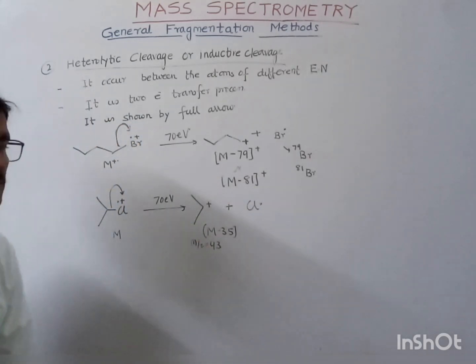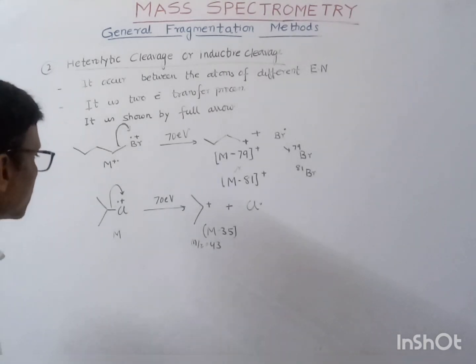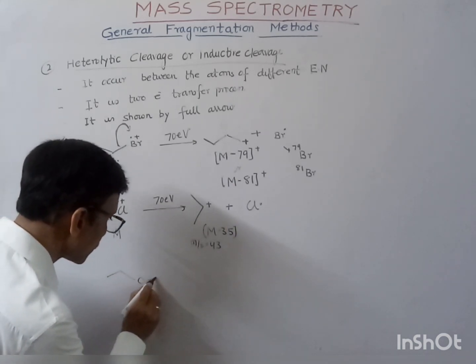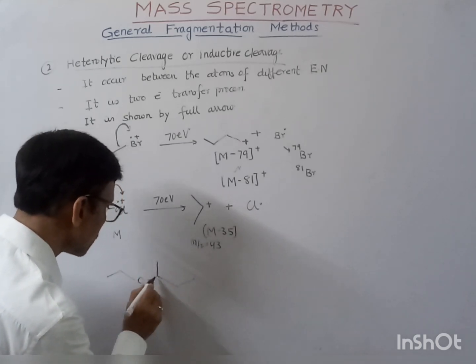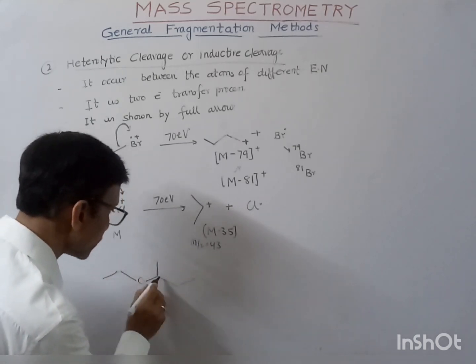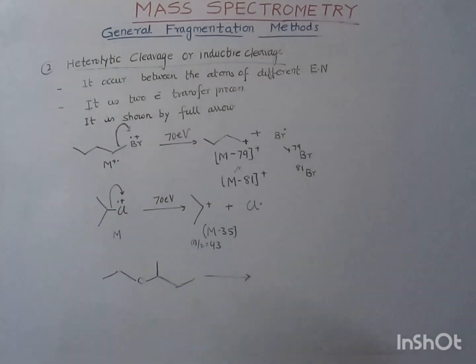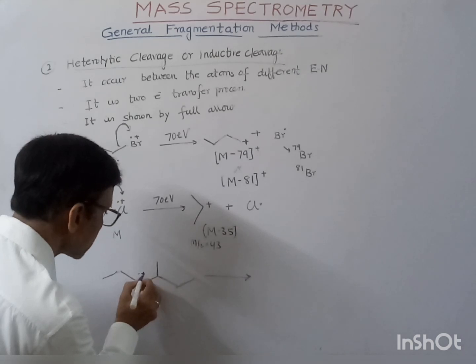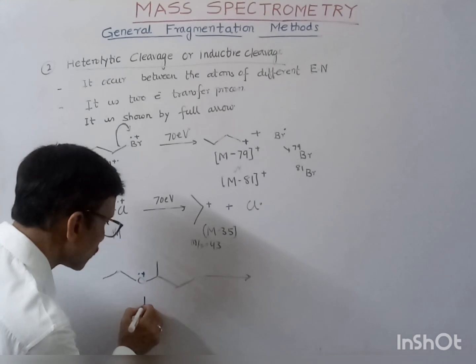In the same way, suppose we have an ether. Suppose this is the ether, and this is the molecular ion peak.